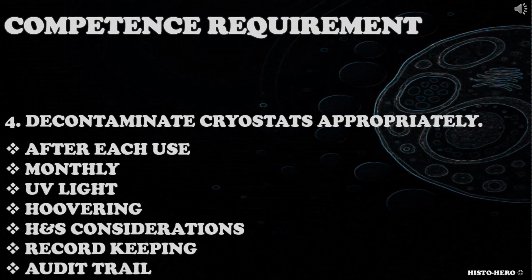When addressing this competence requirement, candidate could consider decontamination after each use, monthly decontamination, use of UV light, hoovering, health and safety considerations, record keeping and audit trail.